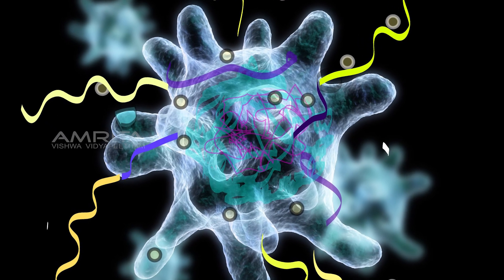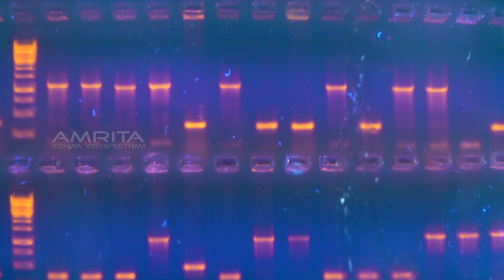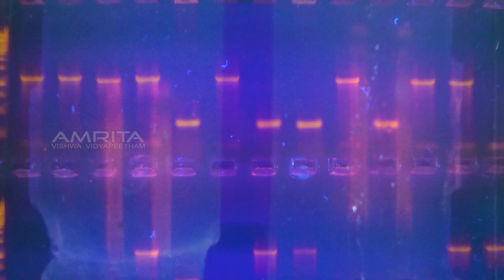Restriction enzymes are also used for gene cloning. The process of restriction digestion is confirmed by the use of agarose gel electrophoresis.